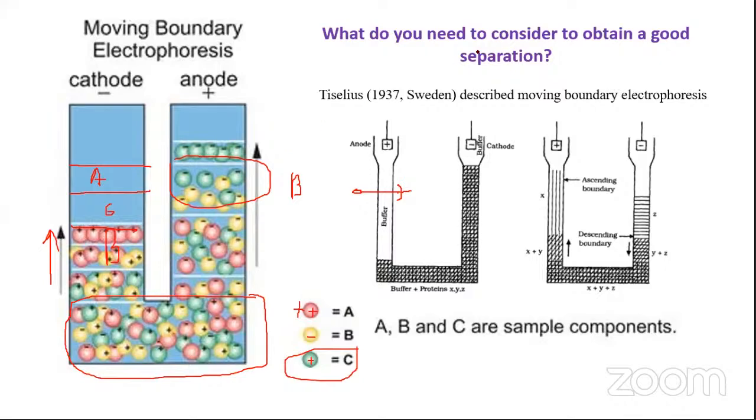Okay. So if that happens, yes, obviously some molecules of B will actually strike the anode and will be destroyed. That means you will lose those molecules, along with some molecules of A which will strike the cathode and be destroyed. So that is also going to be happening.